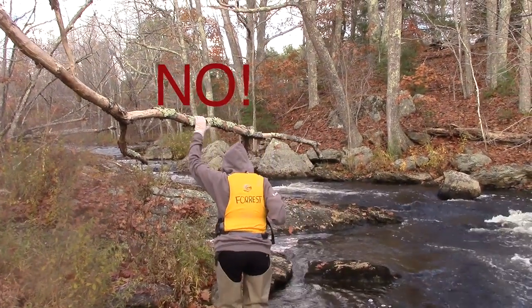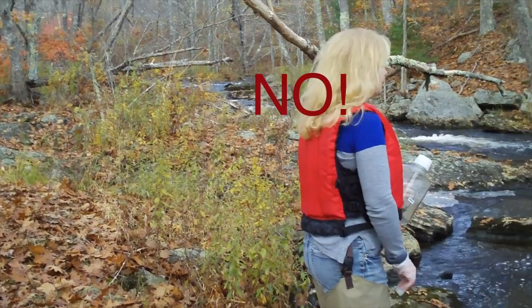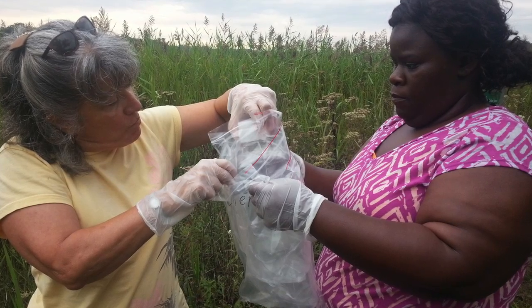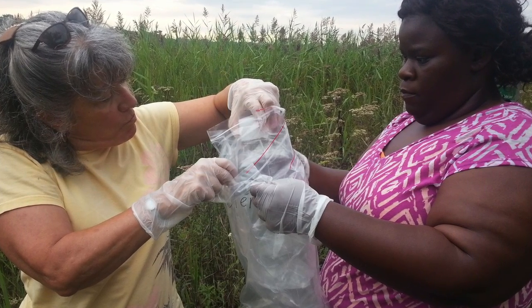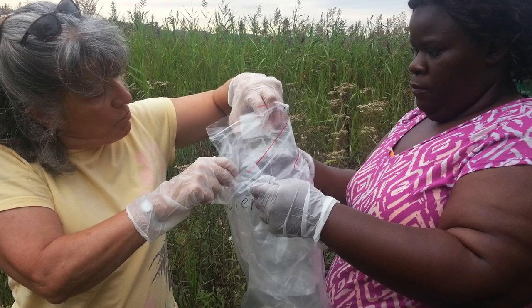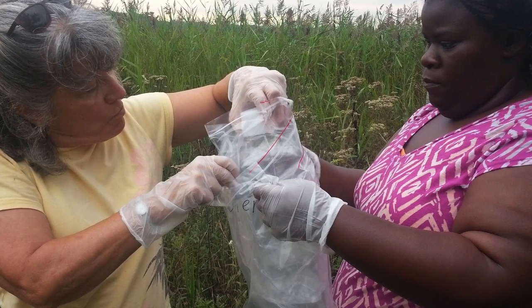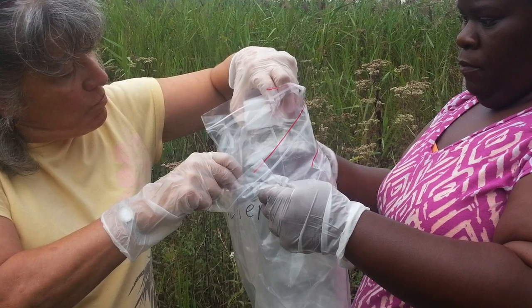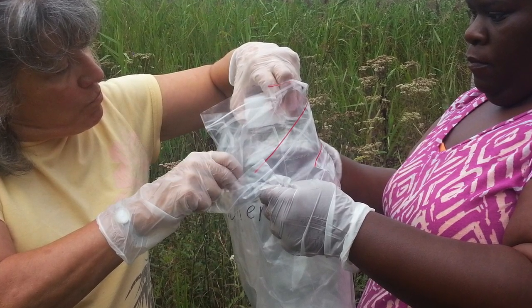At the sampling site, Dirty Hands gets and opens the glove bag and lets Clean Hands pull out a pair of gloves. Once the gloves are on, Clean Hands is careful not to touch the outside of the gloves or anything else. Dirty Hands puts on the other pair of gloves. Dirty Hands opens the outer bag of the PET bottle and does not touch anything inside the outer bag. Clean Hands reaches into the outer bag, unzips the inner bag, and pulls out the sample bottle.